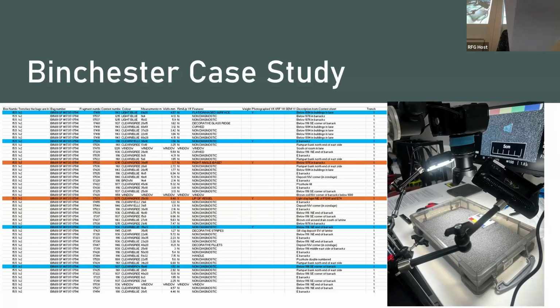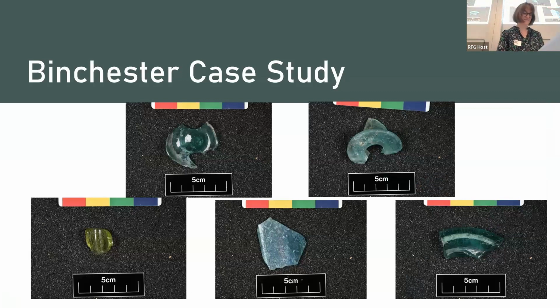From this, I then selected 35 samples based on colour and evenly divided between Trench 1 and 2. I have included some photographs for your enjoyment and to demonstrate the wide variety of material available. Coincidentally, box 15.5, the box I selected, largely contained non-diagnostic fragments, but there were some impressive diagnostic fragments which I photographed that I will not be subjecting to destructive analysis for obvious reasons. Having conducted some basic cleaning and photography, which you saw on my first slide and here, I could then begin analysis.